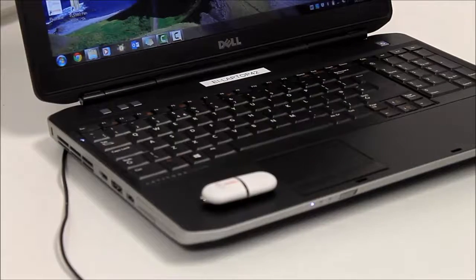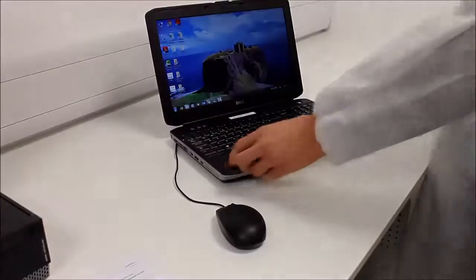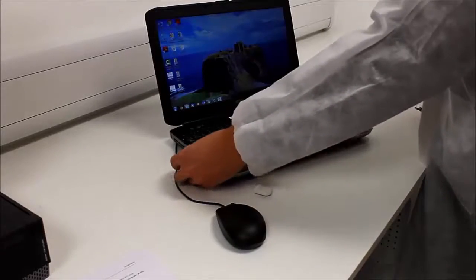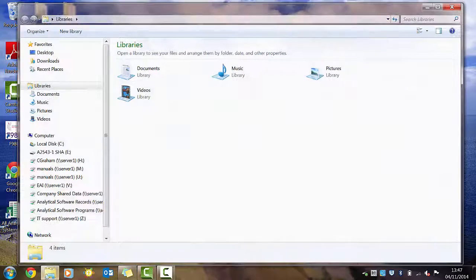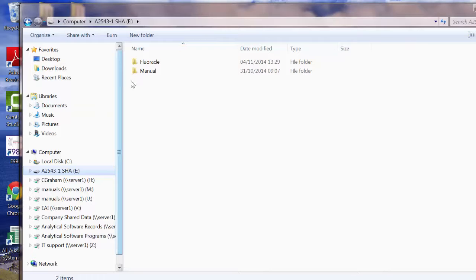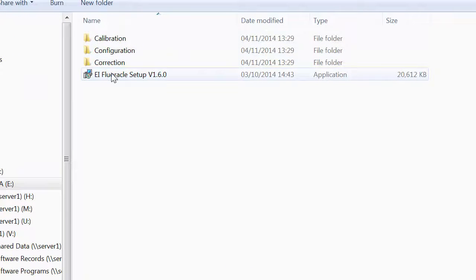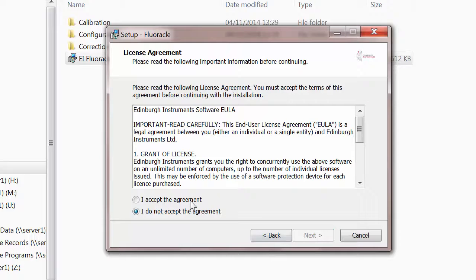In order to begin the installation of the software, take the EI USB key and plug it into the PC. Find the USB key on your PC, open the Floracle folder, and double click on the setup file. Then follow the steps on the installation wizard.